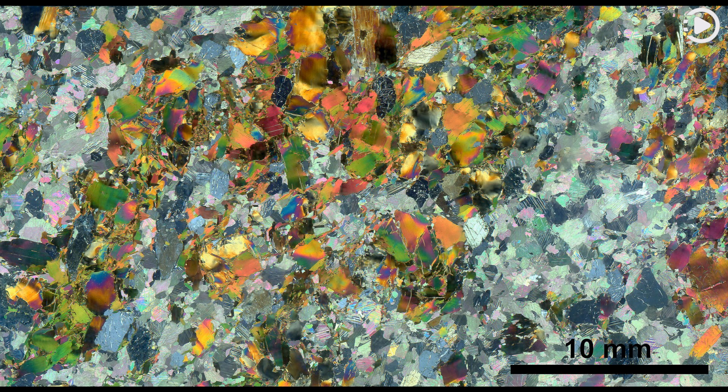A thin sliver of rock is cut from the sample with a diamond saw and ground optically flat. It is then mounted on a glass slide and then ground smooth using progressively finer abrasive grit until the sample is only 30 micrometers, 0.0012 in, thick.